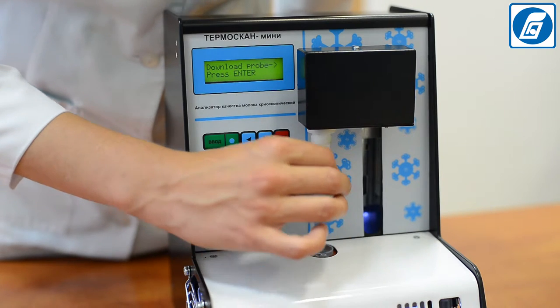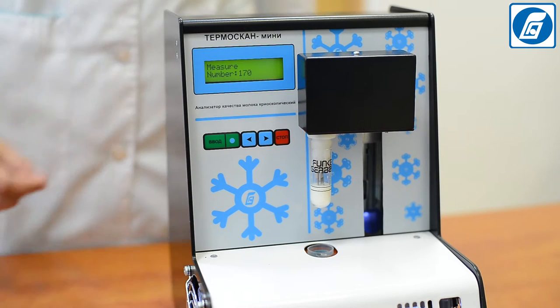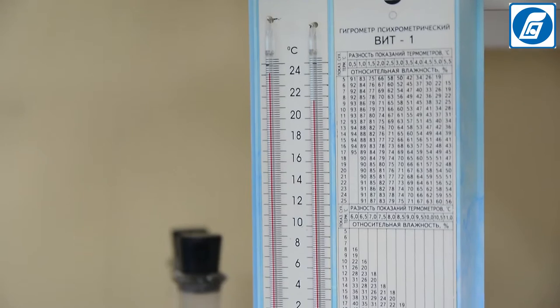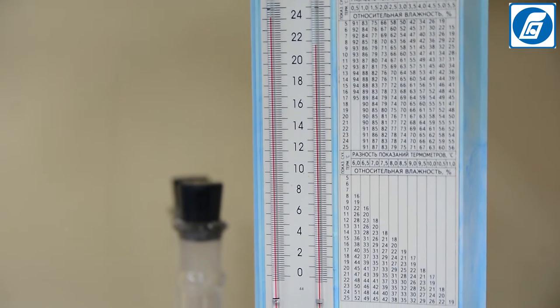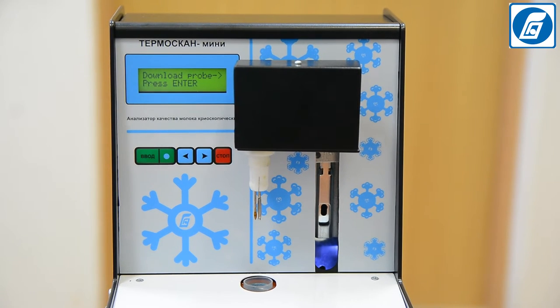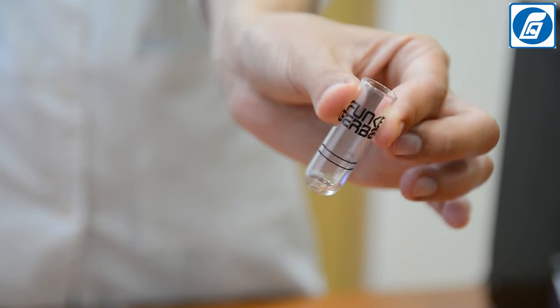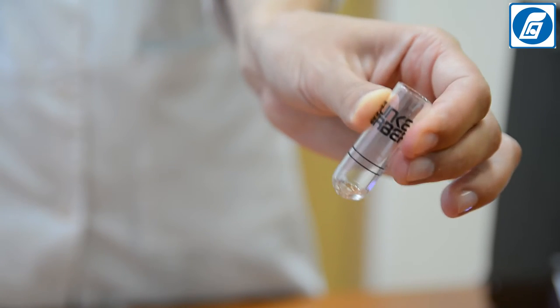If the difference in parallel measurements of the standard solution or milk sample is beyond ±0.004°C, observe the following conditions: the room temperature should correspond to normal operating conditions of +20°C; before each measurement, ensure the probe and hushing wire are clean and dry, wiping with a soft, clean, non-fibrous tissue if necessary; and test tubes must be clean, dry, and free of cracks or scratches on both inner and outer sides.